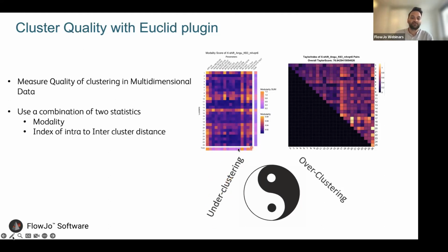Under-clustering is very important because if we have more clusters within a cluster, then we could lose a lot of information in our results. So whenever I have a very high value, like a yellow value here, for example cluster 14 for CD19, that would mean that probably this cluster could be 2 clusters. And the second test is basically the opposite.